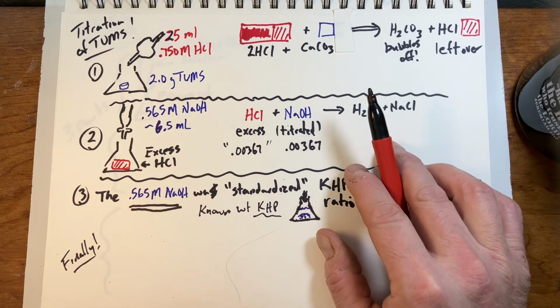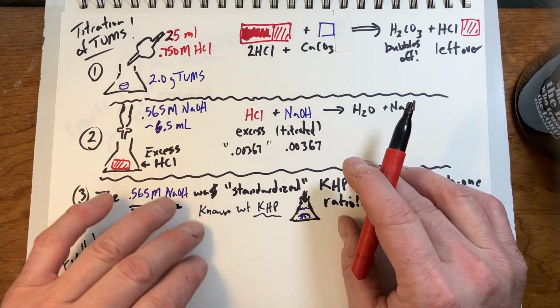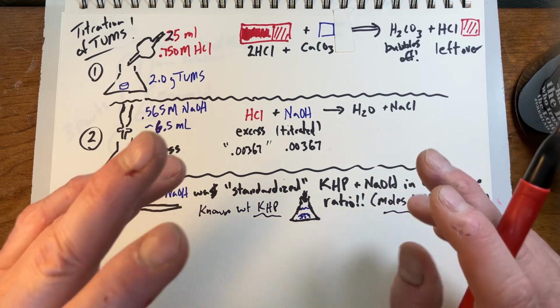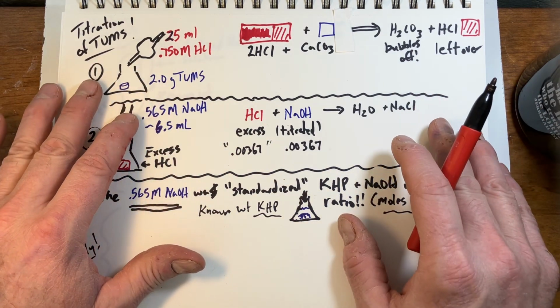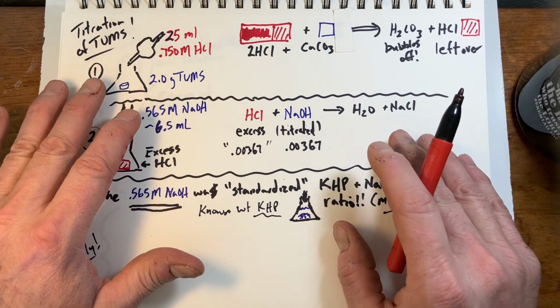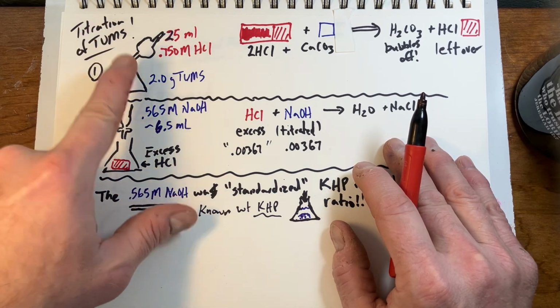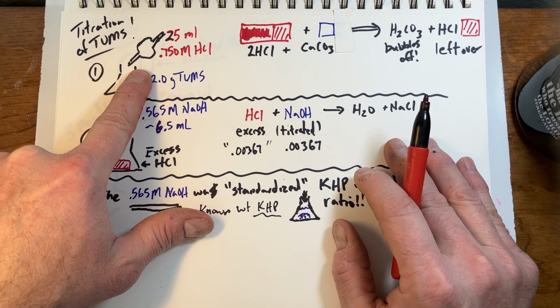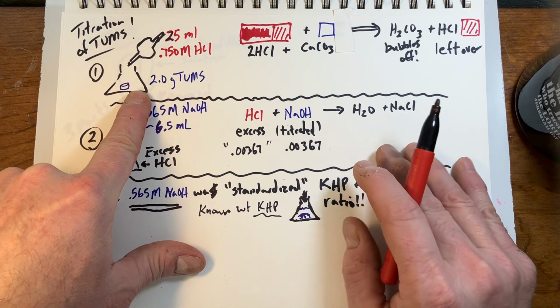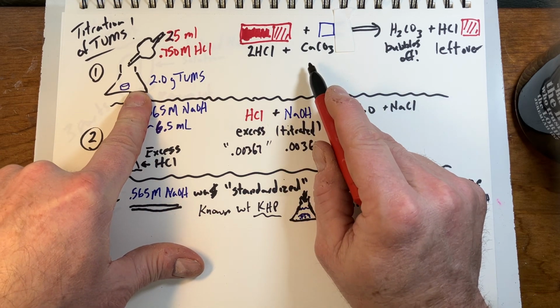So what I'm going to do is go ahead and stop there, because that gives you, I think, just a ballpark view of what we're doing in the Tums titration lab. One, we said we have a certain excess of HCl that we add, more than what we need. Why? To neutralize completely and quickly the Tums, or the calcium carbonate, in 2 grams of Tums.